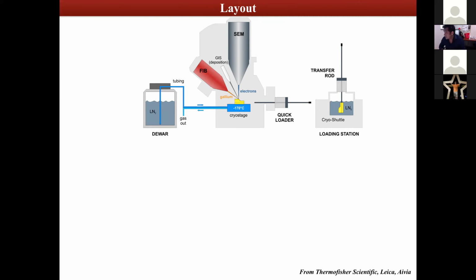studying the tissue sections, the subcellular organelles, or very tiny regions or domains of material science samples, like soil samples, magnetic materials. Although, let me tell you that this instrument is not capable of handling materials which are very rich in iron, cobalt, or nickel, because those are all magnetic materials. The rest of the materials we will be okay to study.